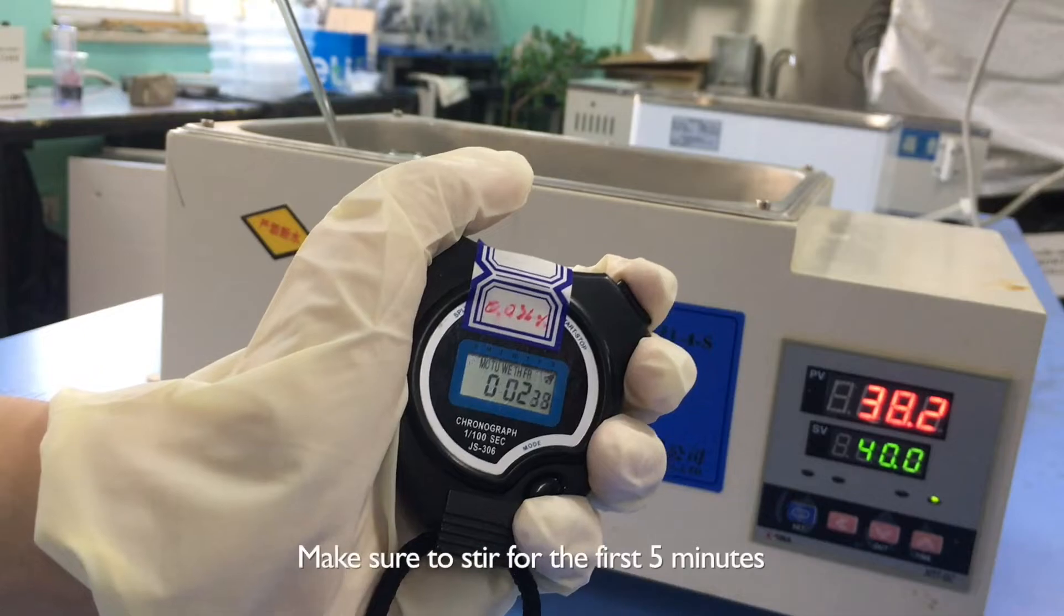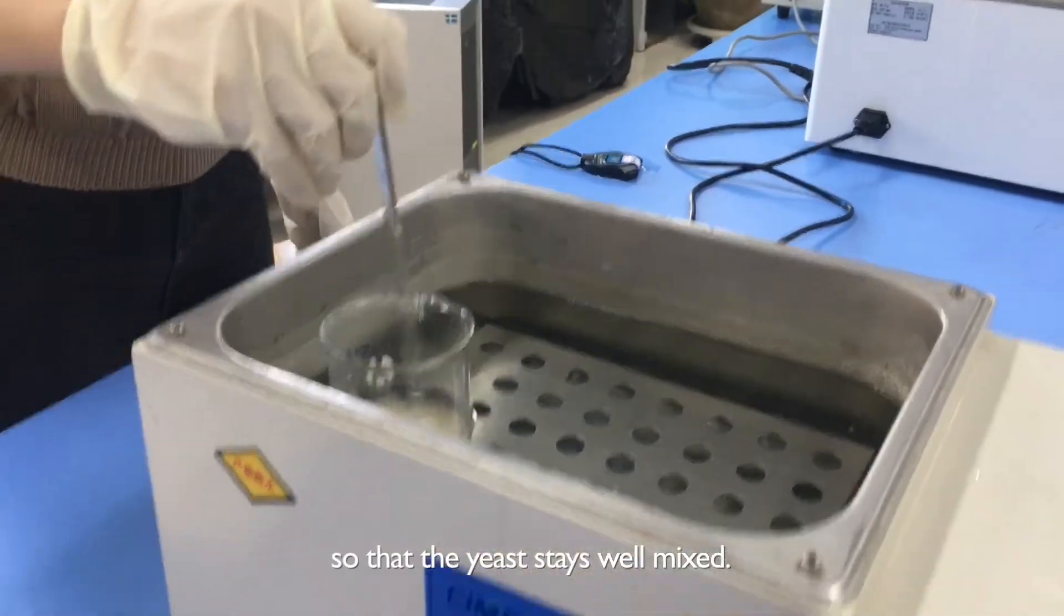Set the timer for 30 minutes. Make sure to stir it for the first 5 minutes so that the yeast stays well mixed.